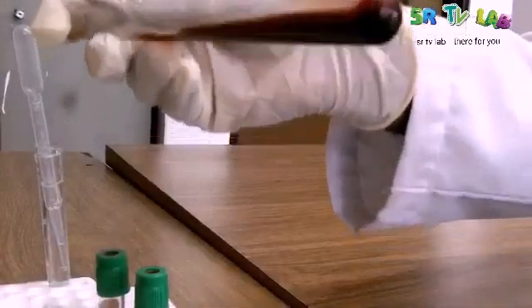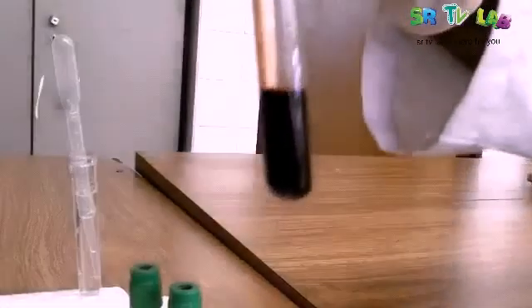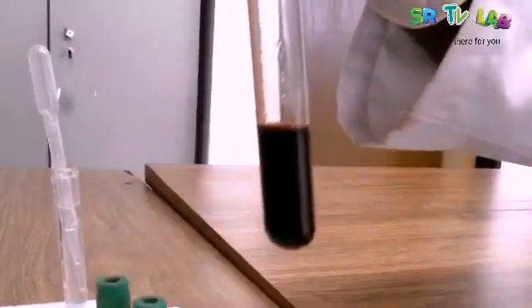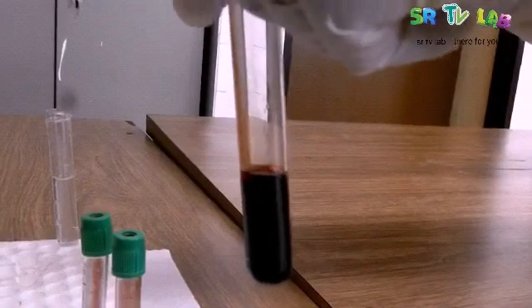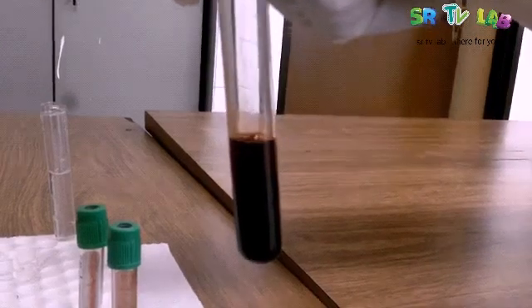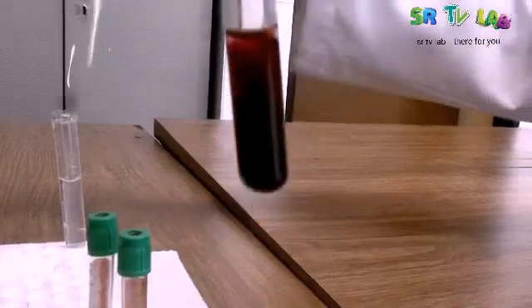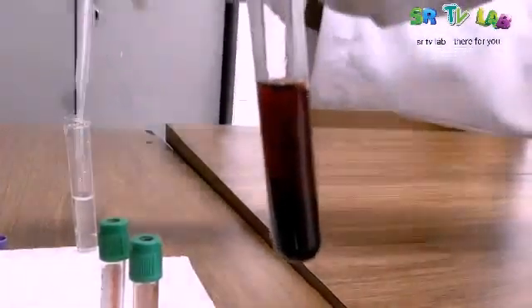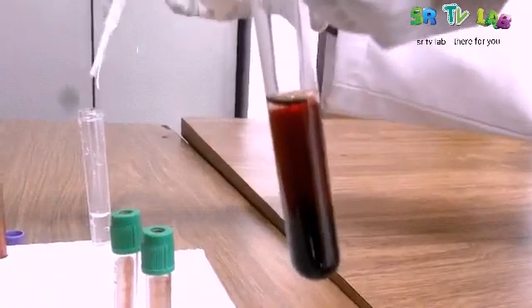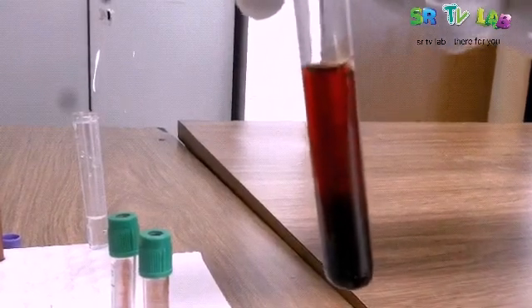We are shaking now. The bottom part and the upper part are now mixed. This means water has entered into the red blood cells — red blood cells are water soluble. Let's add more water. We are adding more water and then we're going to shake again. It has already started working. This is an indicator that if water is added into red blood cells, the red blood cells are going to be destroyed.